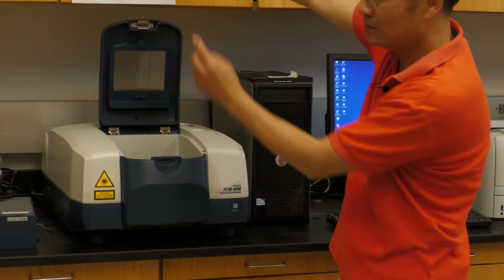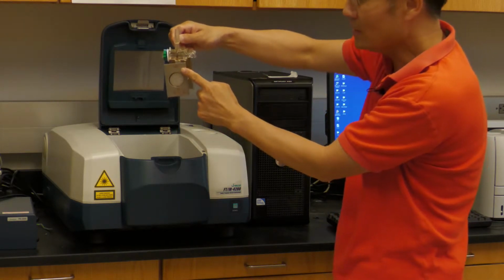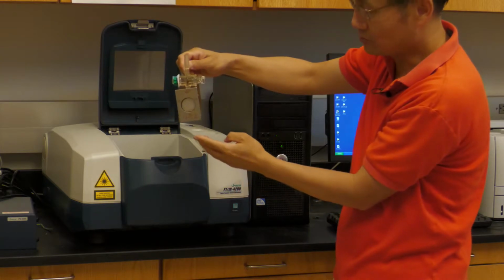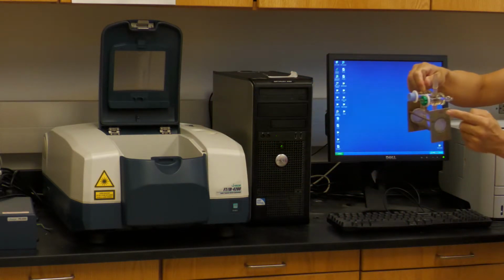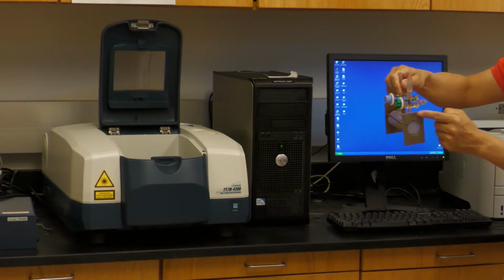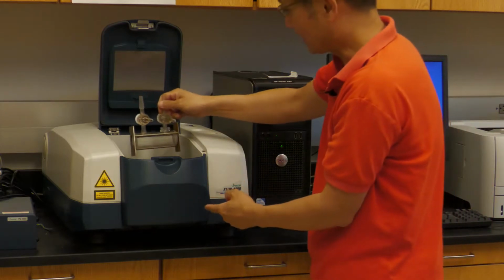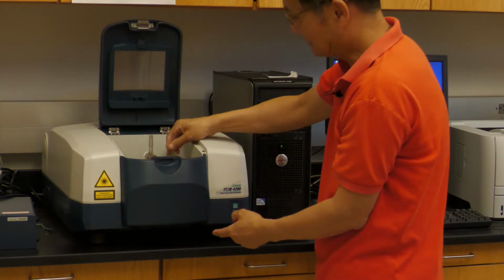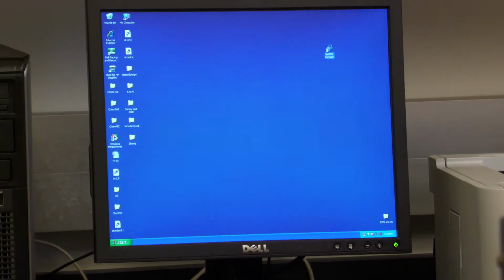So slide the side with this arrow and the 452 number into your machine, okay? So slide this side in, then cover it. Now, come here, we will use this program.